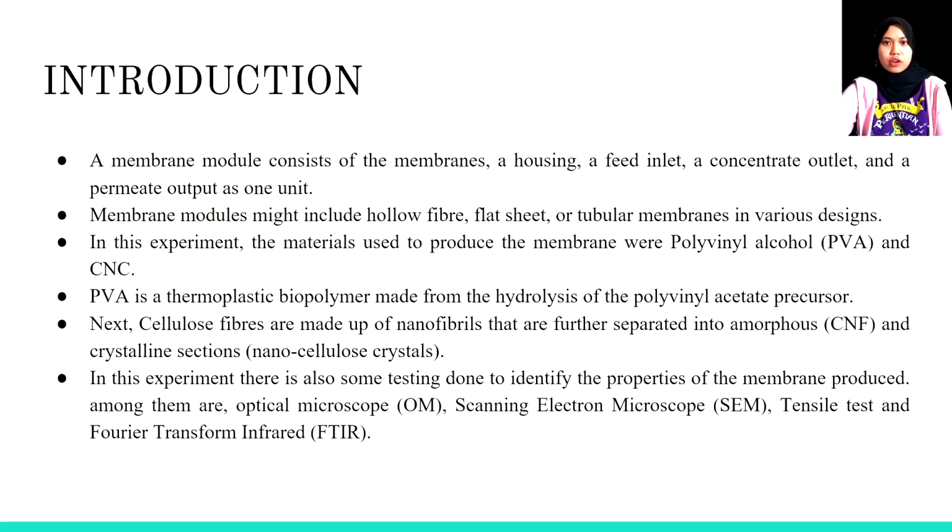Membrane technology has evolved into a technology with a wide range of separation capabilities. It includes not just the removal of turbidity, pollutants, and microorganisms from underground and surface water supplies, but also additional methods. In this experiment, the materials used to produce the membrane were polyvinyl alcohol (PVA) and CNC.